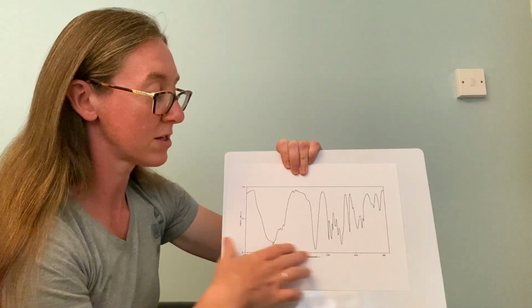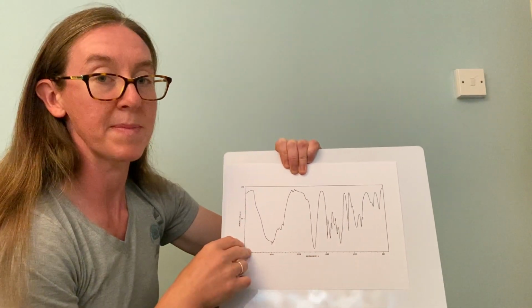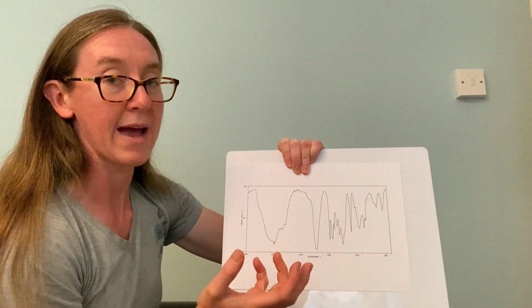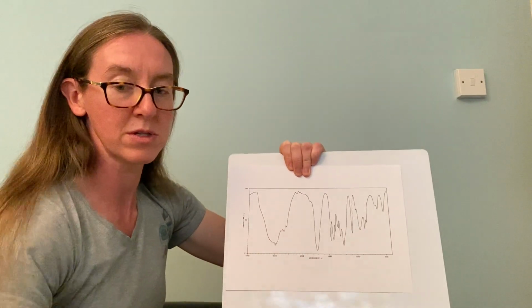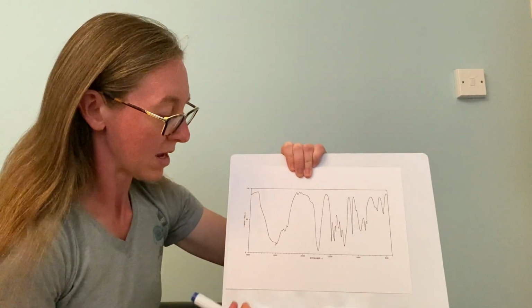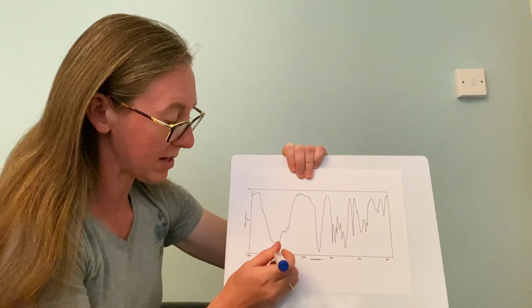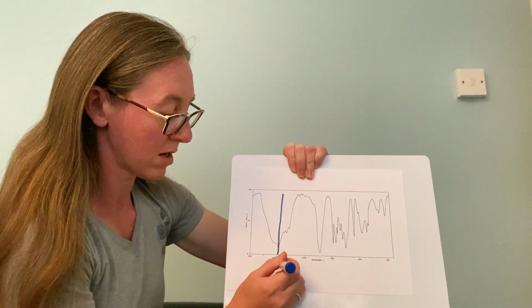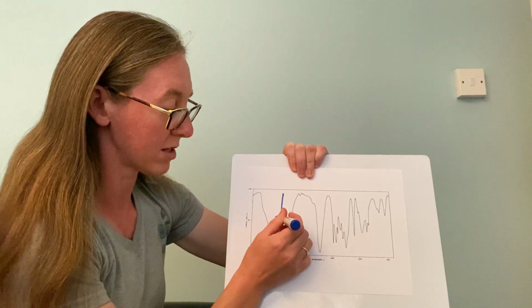So infrared looks like this and tells you about bonds. I often think it's a good idea to be aware of 4 particular bonds, just because then you can more quickly look at the spectrum. So a peak pretty much bang on 3000 is a CH.